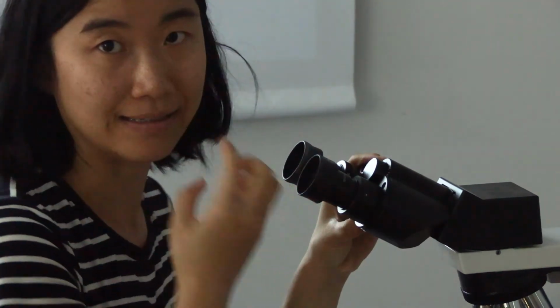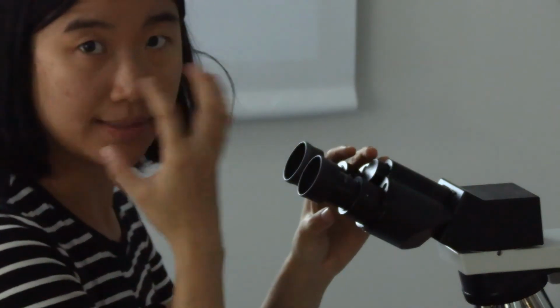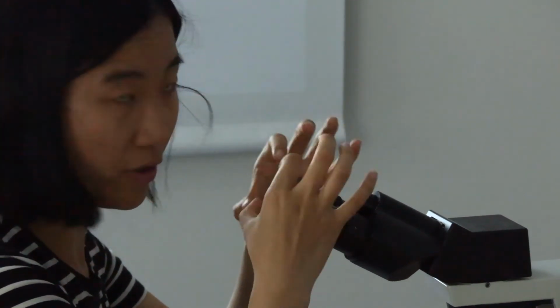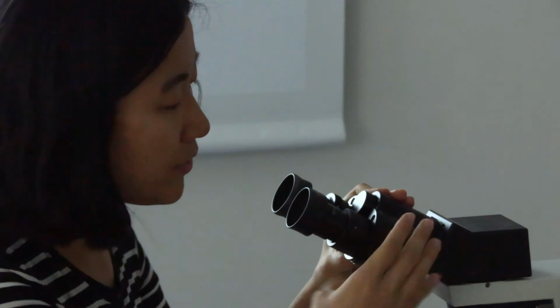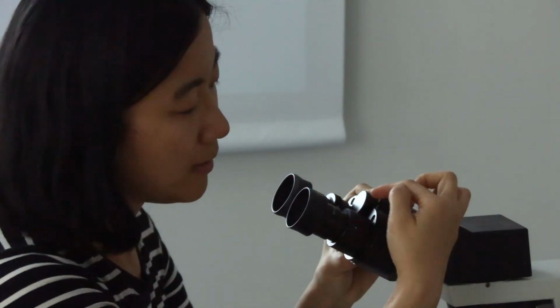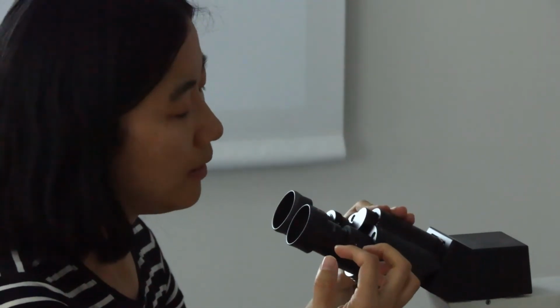What I did is I looked through the two eyepieces at the same time and tried to turn the two circle fields into one. But you also have other methods. For example, there are numbers here that show you the distance, and you can ask your friend to measure the distance between your two eyes and set it up here.